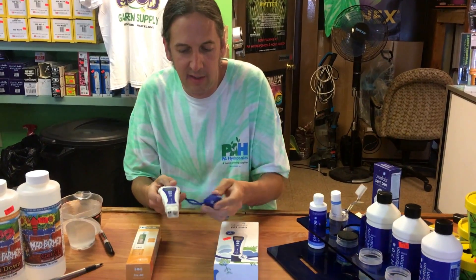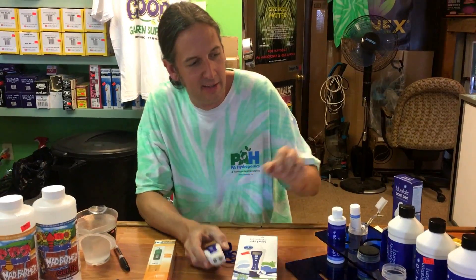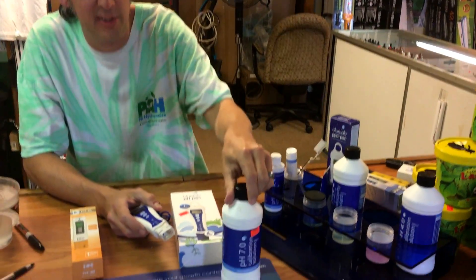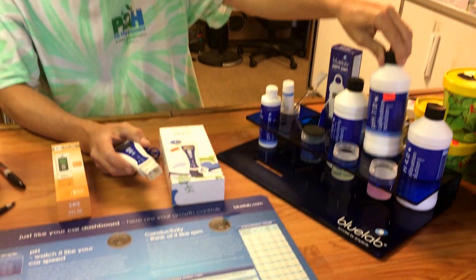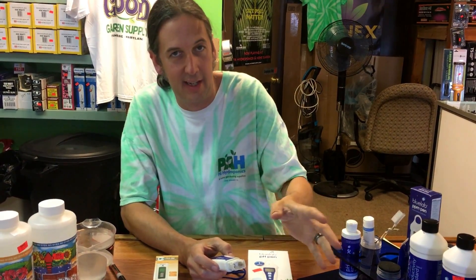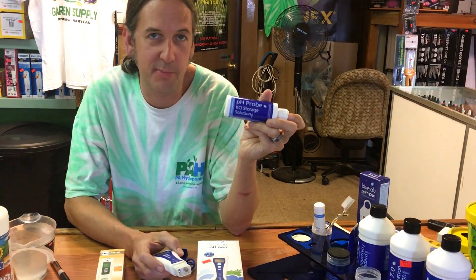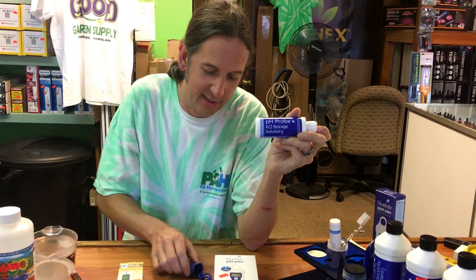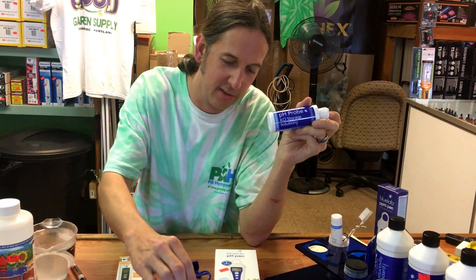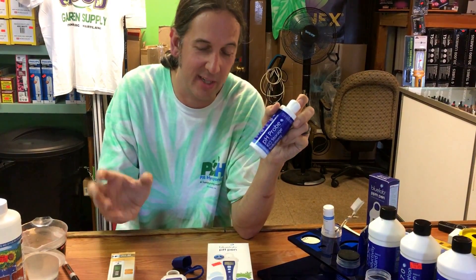When you store your meter, that's a big question everyone has. Some companies say store it in a 7.0 solution, but even when the meter is off, those ions are constantly moving in and out. Once the potassium chloride runs out, the meter is done. If you store it in actual storage solution — which is potassium chloride — the ions don't try to read while sitting there, so it'll last much longer. I recommend buying the actual storage solution.